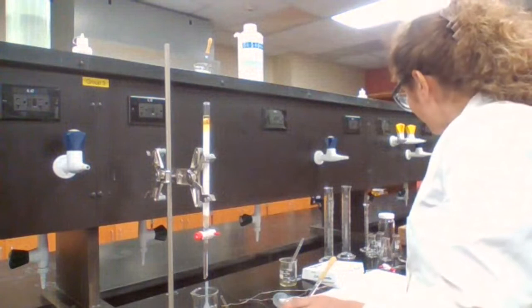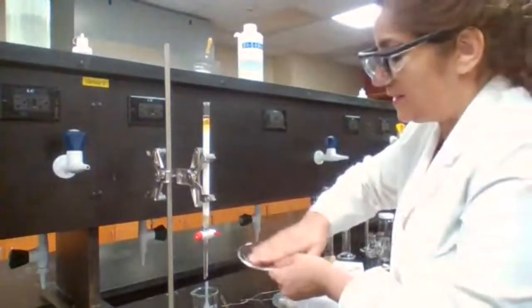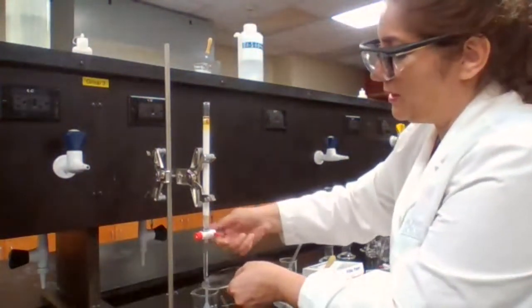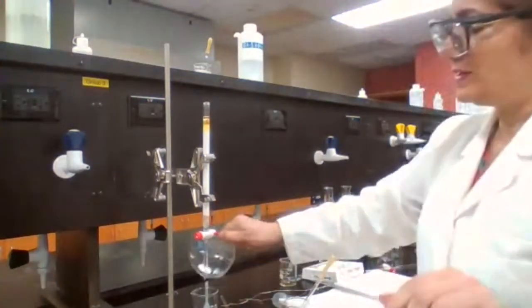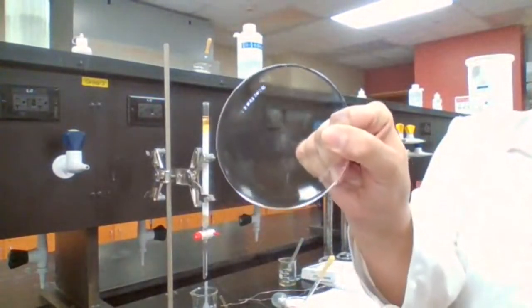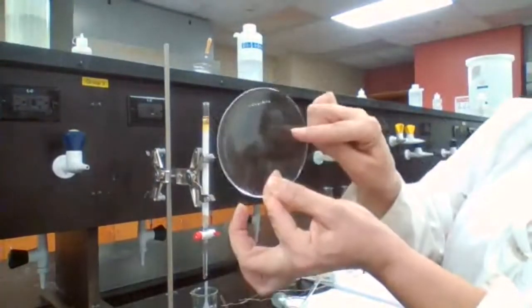To test it, I take a drop. I'm going to show you how it looks when there are no chemicals. My compound 1 is not out. Fraction 1 is not out. When I dry it out, the glass is clear. See, it's clear. There is no white residue here.